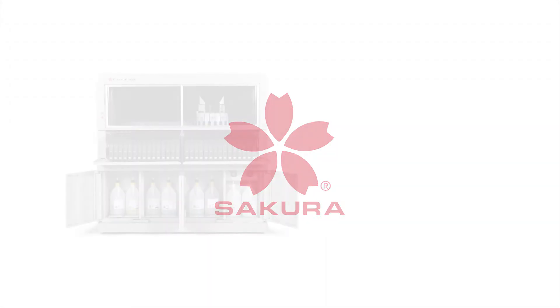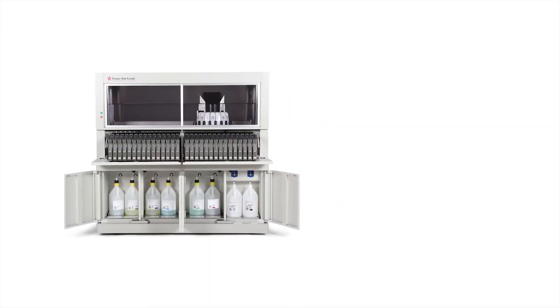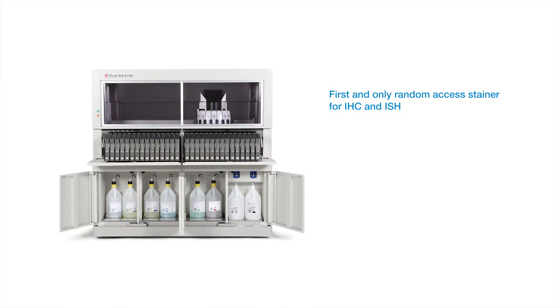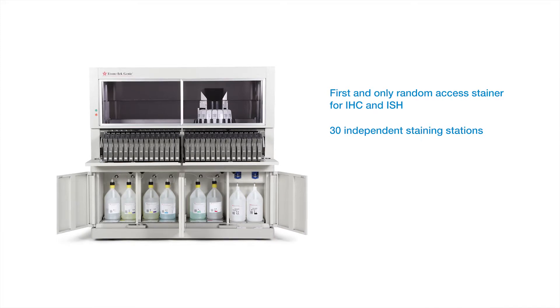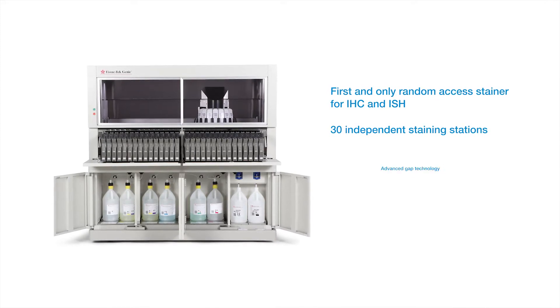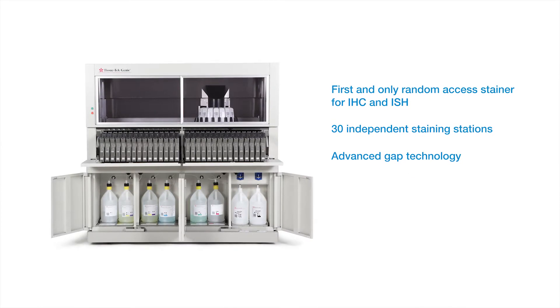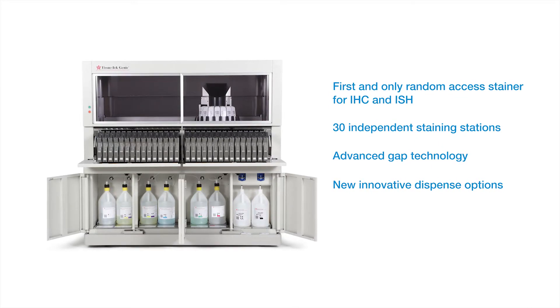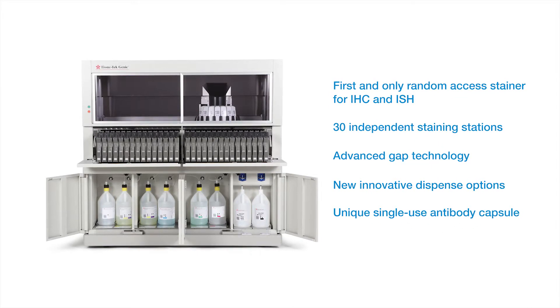In 2016, we launched the Gini Advanced Staining System, the first and only random-access IHC and ISH stainer, with 30 independent staining stations, utilizing advanced gap technology, and with new innovative methods of dispensing antibodies and reagents, including the unique single-use antibody capsule.